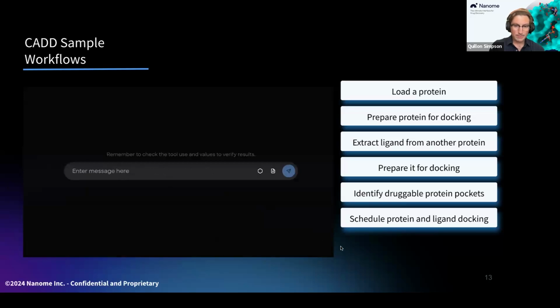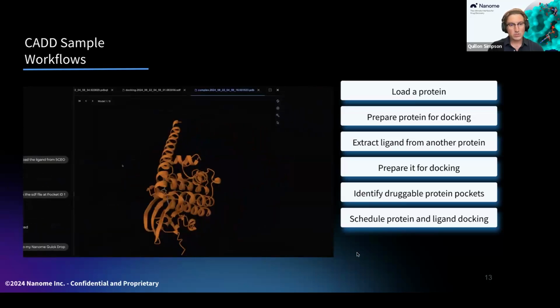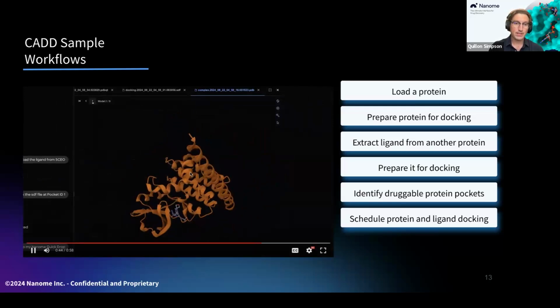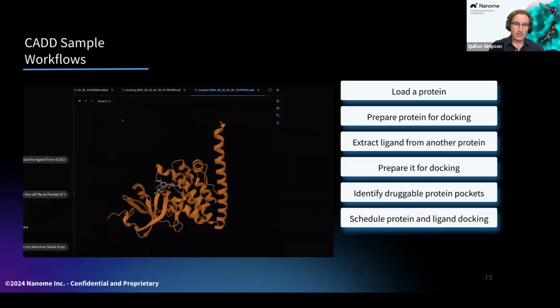So not only that, but this system is designed to integrate holistically. In that last prompt, we actually just sent this model that we have represented here in the web app to a Nanome instance. So you could be viewing this exact same structure in VR space.